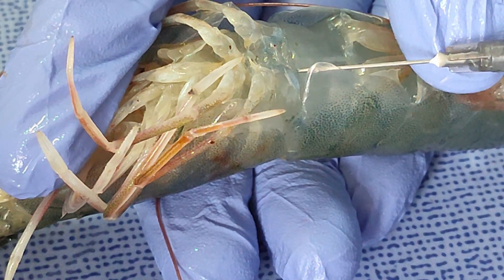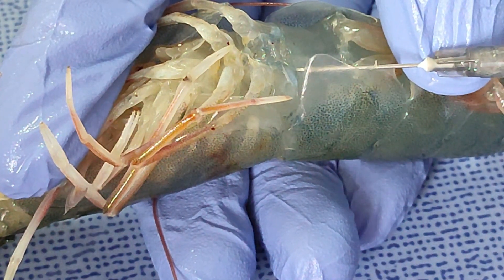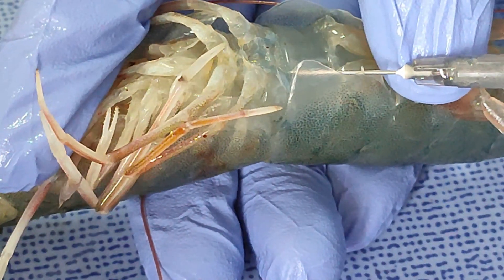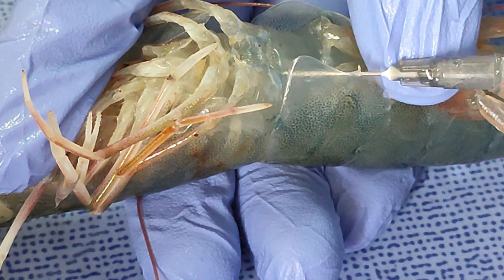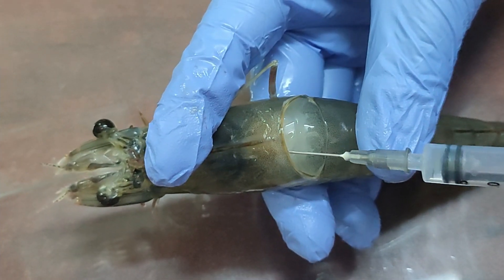The first method is to insert the needle into the ventral sinus and draw the blood. It is easy and non-destructive — shrimp survival chances are higher after this procedure. The second method is to insert the needle into the heart and draw the blood.